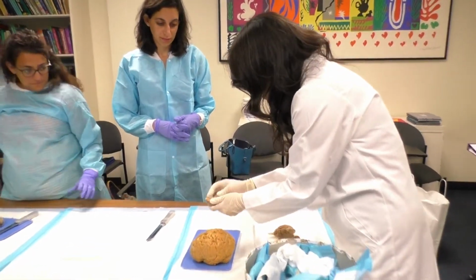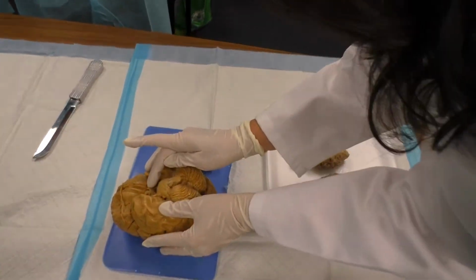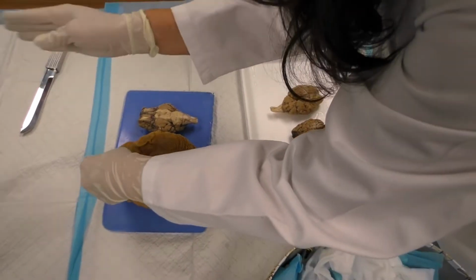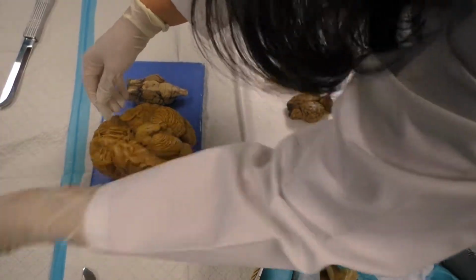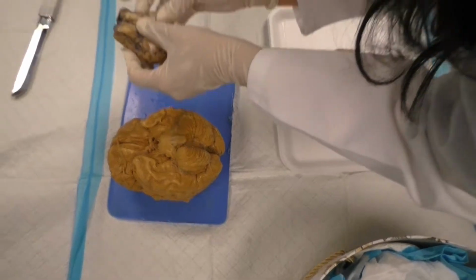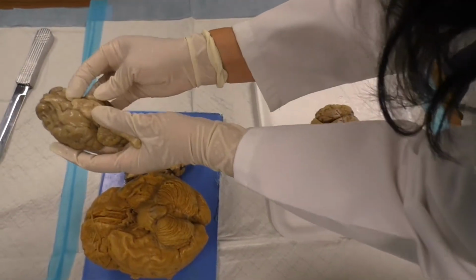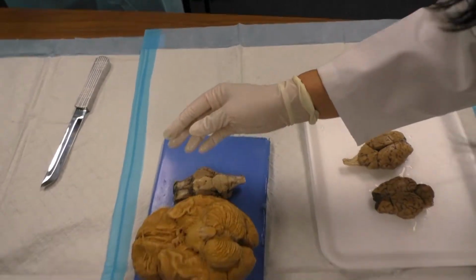And then you can follow it up. The olfactory nerve is right here. Here's the optic chiasm, that crossing. So your eyes in the human are sitting right here, and all of the information from the right visual field goes to the left side of the brain, and all the stuff from the left visual field goes to the right part of the brain. And let's see. This is the vestige of that cross right there. Let's see if we can see. This is better. You see that cross? That's the same optic chiasm.